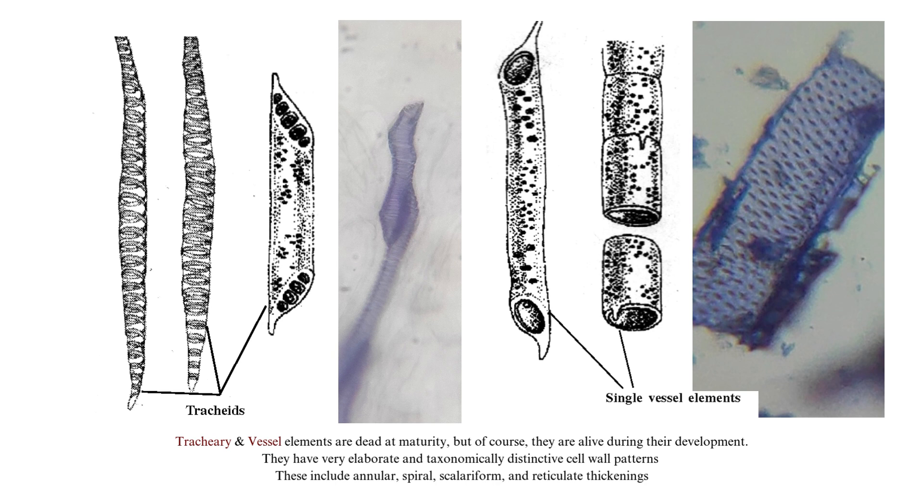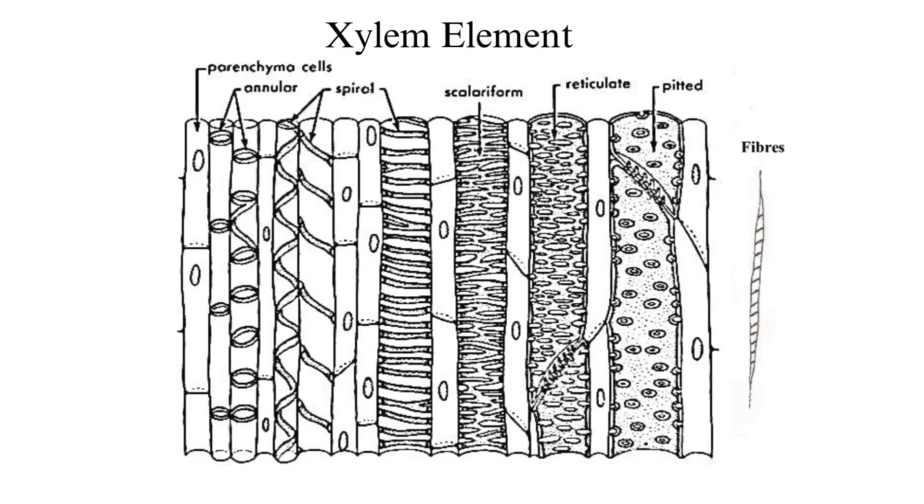They have very elaborate and taxonomically distinctive cell wall patterns. These include annular, spiral, scalariform, reticulate, and simple and bordered pitting. Here you can see the different types of wall patterns in the xylem element — the vessel and the tracheary element: annular, spiral, scalariform, reticulate, and pitted. Let's observe the slide under the microscope.